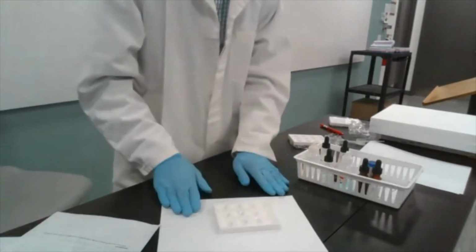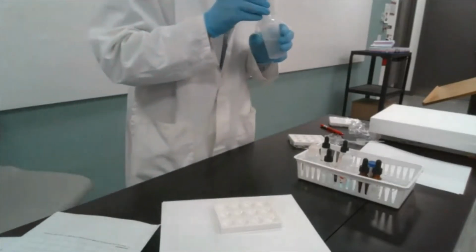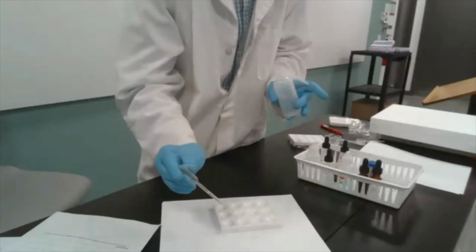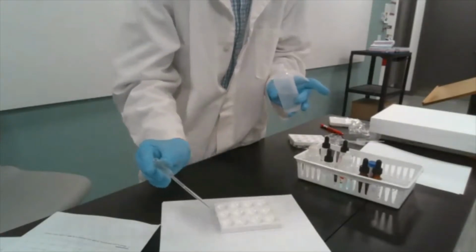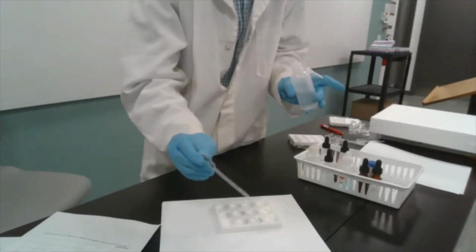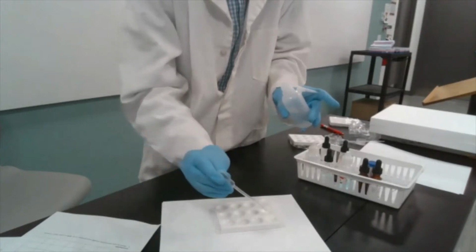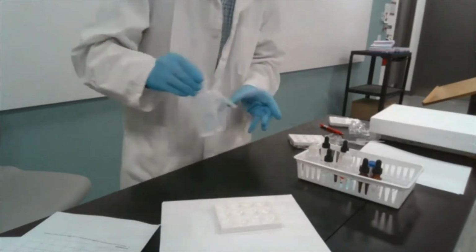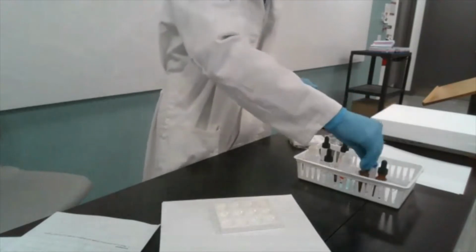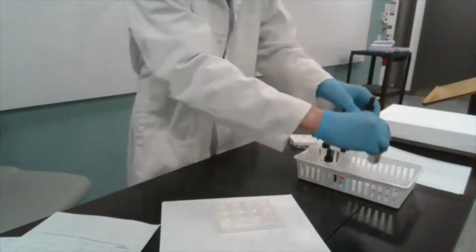So this is what I'm going to dispense here. I'm going to grab some distilled water, and I'm going to dispense some water into the first row of the wells there. So I'm going to add some water here. Okay. The second row of the wells, we're going to add sodium hydroxide.